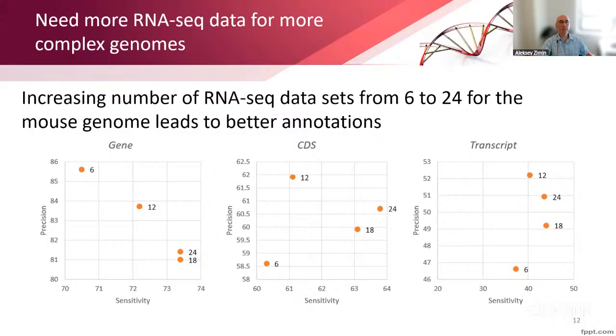Unfortunately, there is no better way for us currently to get UTR annotations rather than just taking them from transcript annotations. And what we do actually in EviAnn, we compare data between different RNA-seq runs. And if different RNA-seq runs give us different coordinates of the UTR regions, we take an average of that coordinate. So, an average of the transcription start site and transcription end site.